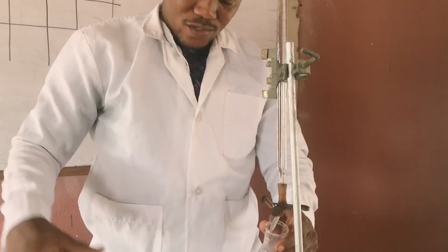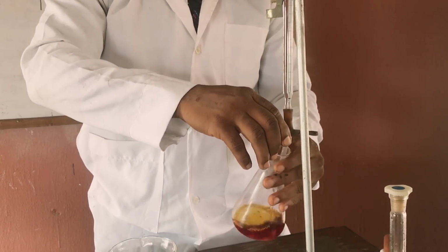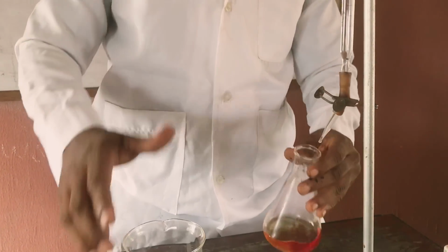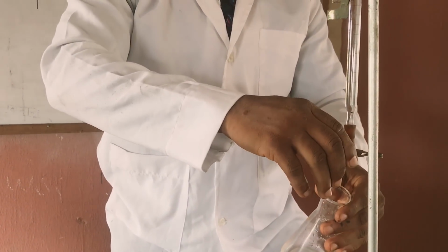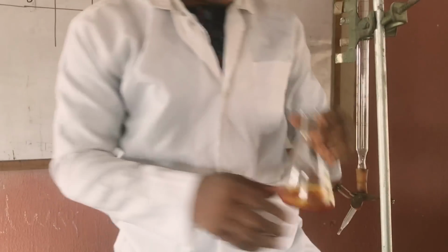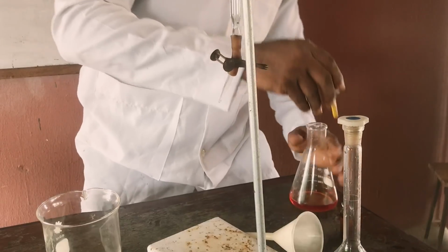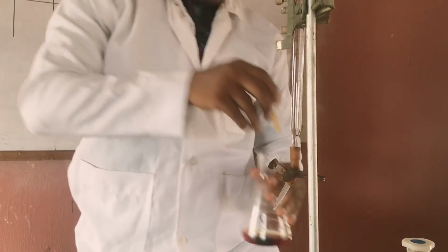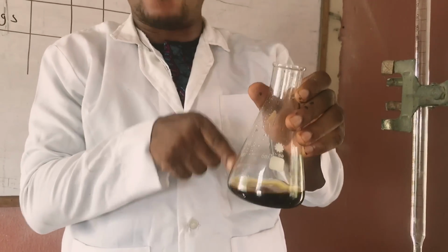So let's go. Look at the solution we started with. So let's see. You can see that now. Can you see? You can see, this is a light yellow. Then let's have our starch indicator now. I'm using about 2 drops, 1 and 2. So you can see a blue-black, indicating that you still have iodine here.